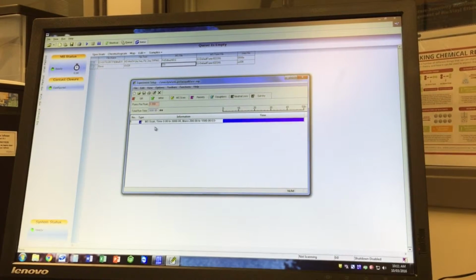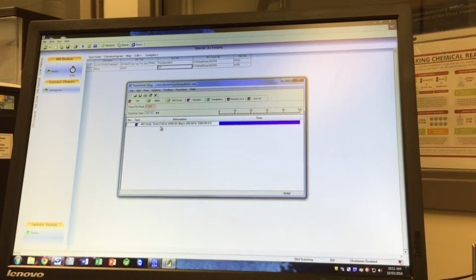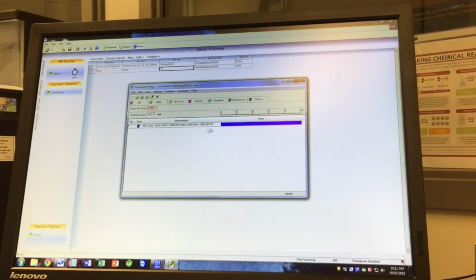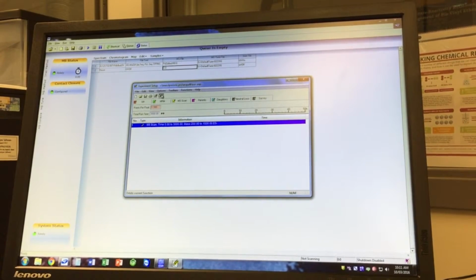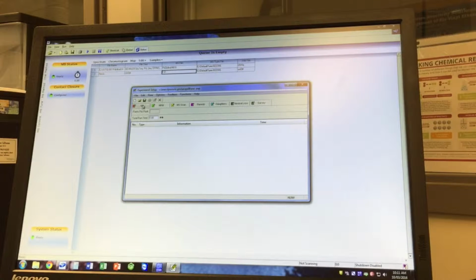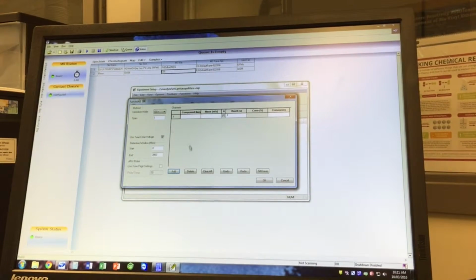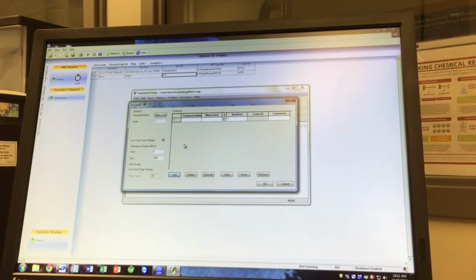So right now what we have is a full scan, MS scan, from 0 to 3,000 minutes, so basically until I stop it, and my range is 200 to 1,500 Daltons in negative ion mode. But for now, we'll just get rid of that. So as you can see up here, these are all of your functions that you'll want to run. SIR is basically a method to sit on one or several masses and just scan that. Not looking for any fragments, but looking just at that mass window.